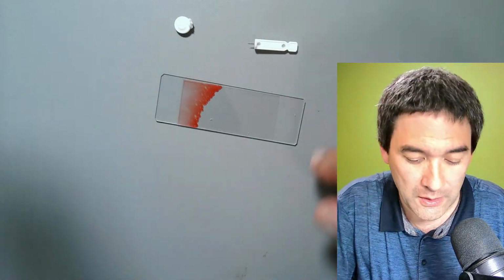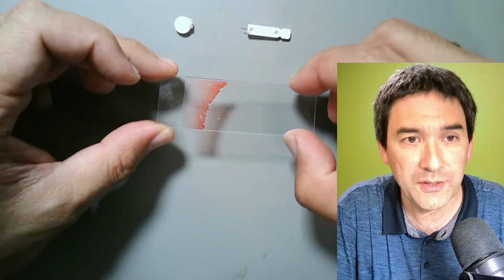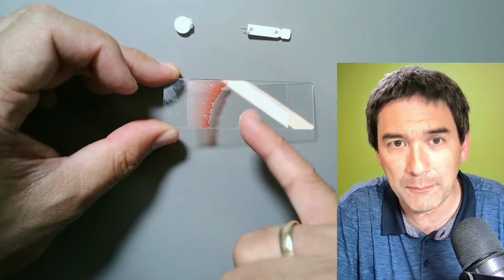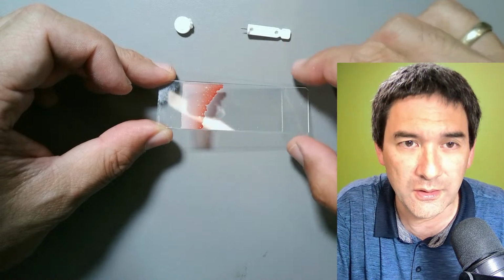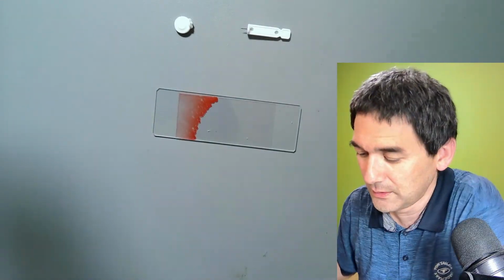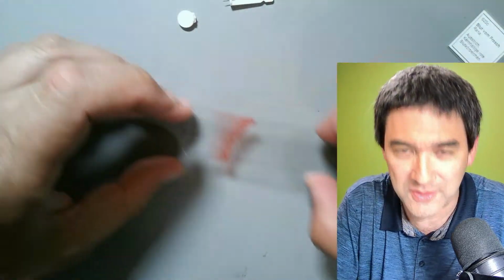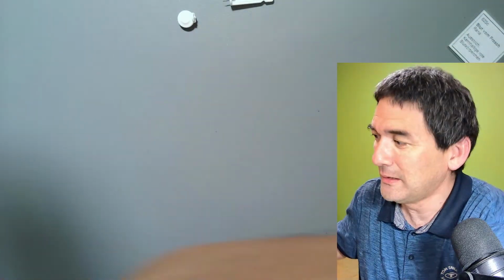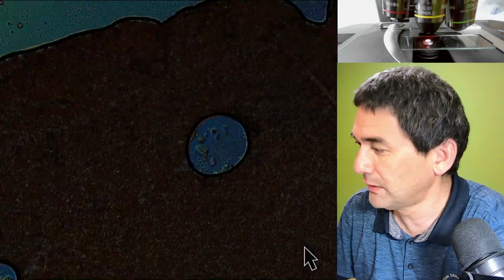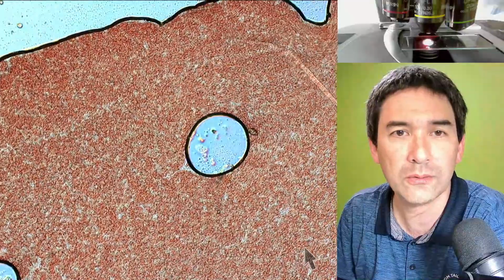Also mention here. So I'm going to put this now under the microscope, and we can actually see that the blood is now slowly moving across due to capillary action beneath the cover glass. So let's have a look. Okay. And then I guess I have to prick myself multiple times today again. Okay. So, let's see the scope view again, and we have to, of course, turn up the light. Here we go. Okay.